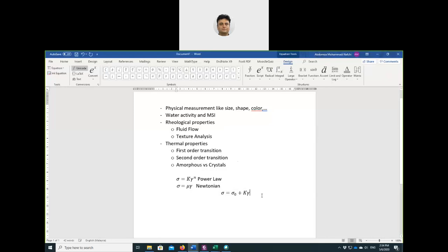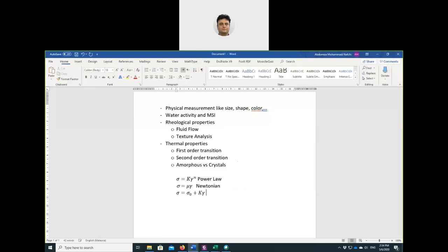This is the Bingham plastic. Okay, so we have these three different models.